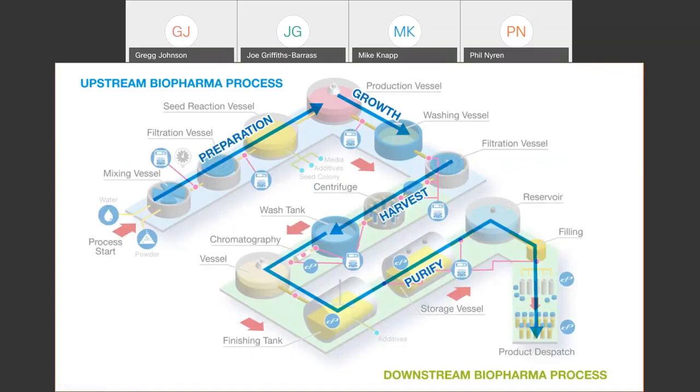So beginning our deep dive reviews, our first step in the cell culture workflow is preparation, a critical support process in bioprocessing. Sometimes this process relies on prepackaged or standardized media, or preparing custom media blends in-house from ground powders or concentrate. Typically, these will require filtration to purify it before use in the cell culture process.